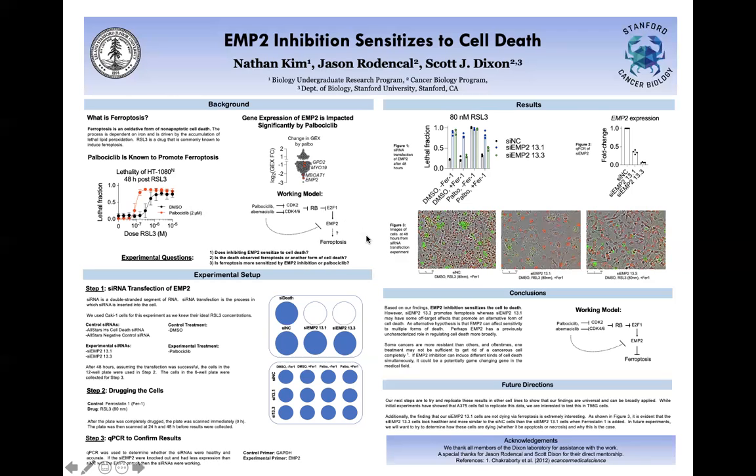The whole goal of the experiment, as you can see by the question mark, was to determine whether or not EMP2 induced or inhibited ferroptosis. The experimental questions in my experiment were: 1, does inhibiting EMP2 sensitize to cell death? 2, is the death observed ferroptosis or another form of cell death? And 3, is ferroptosis more sensitized by EMP2 inhibition or by palbociclib?